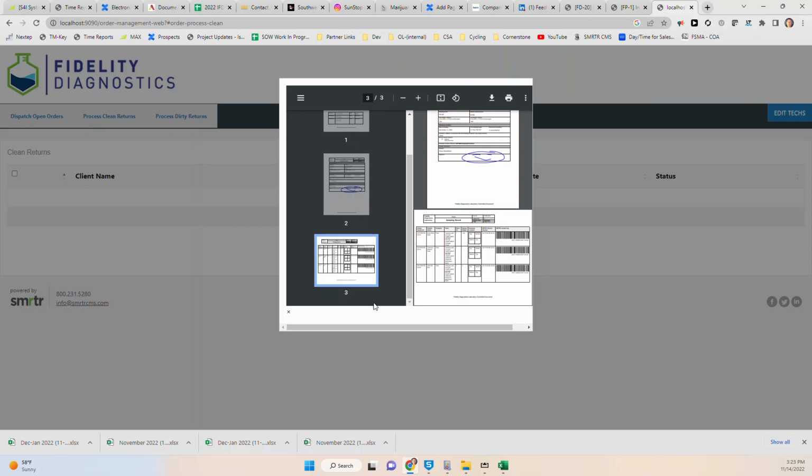And in this sample, we're not adding the pictures on, they're just being saved, but we would add additional pages with pictures if desired. Currently, this is set to match the state requirements.